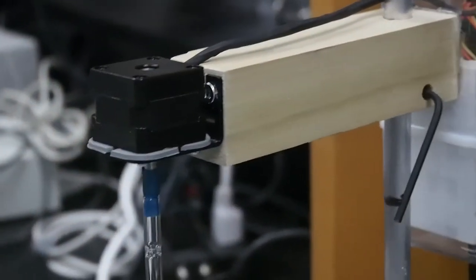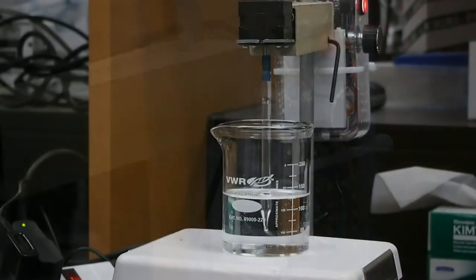Generally these units cost upwards of a thousand dollars, but I've built this overhead stirrer for approximately a hundred Canadian dollars.